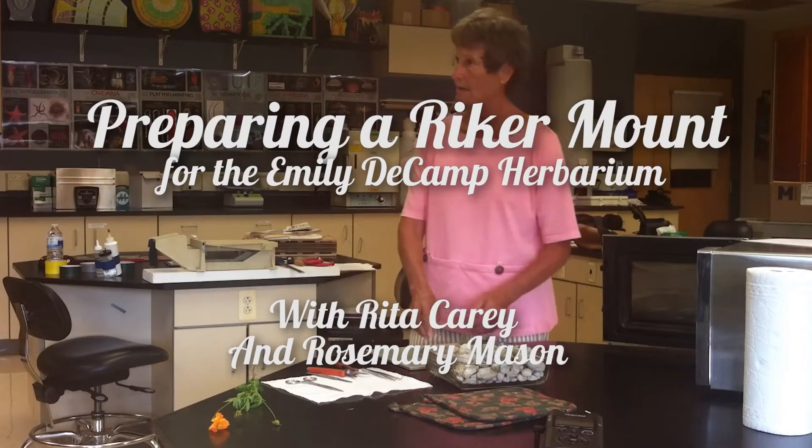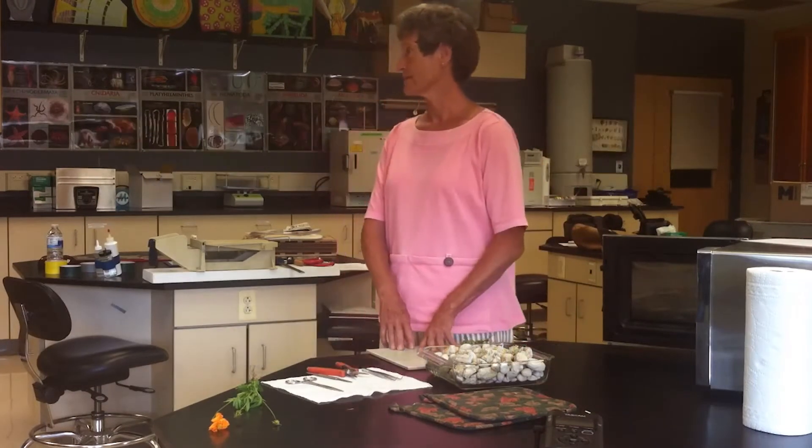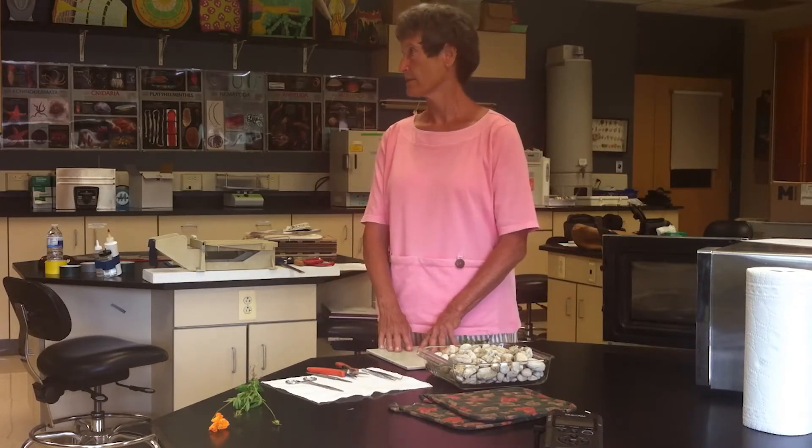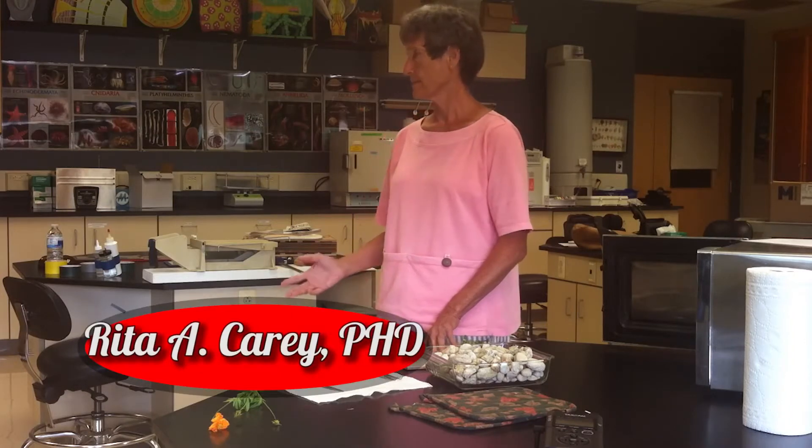Good morning. We're going to talk about drying plants and mounting plants in the Riker mount for the Emily DeCamp herbarium. Please keep in mind that the purpose of these mounts is for the public, for public education — to help people identify plants and learn something about them.